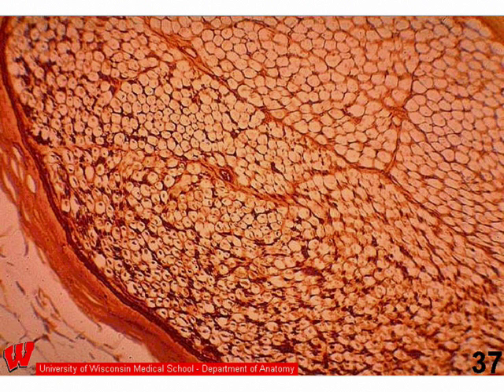This is a similar section, but with a completely different staining method. So if we look here at the periphery of this nerve in cross-section, we see a dense connective tissue. And then there's this very darkly staining line, which in this low magnification light micrograph represents the perineurium, which we'll see later has 1 to 5 cell layers that completely isolate the axons on the inside from any peripheral substances.